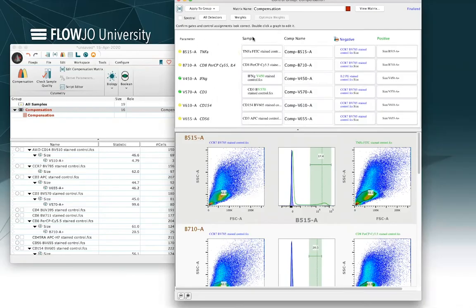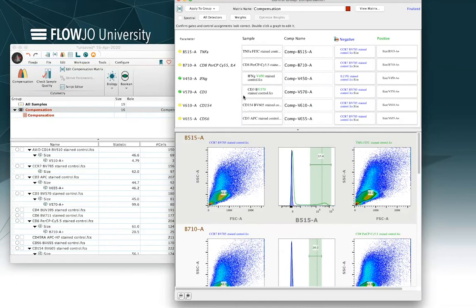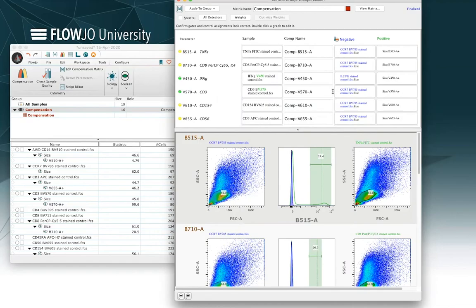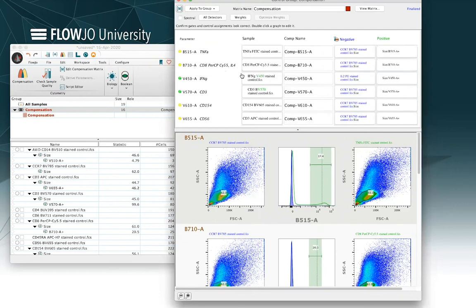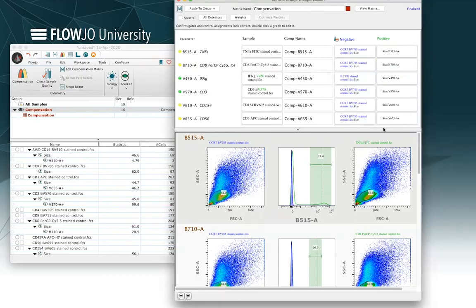In this case I'm fine with those parameters, those are the ones that I just checked. Next thing you should do is look a little bit further to the right and notice that we're selecting a sample for each parameter. In this case we've got the single stain control parameter for each detector correctly assigned. Finally, the comp name you can adjust if you want to, but I'm just going to leave the default here, comp with my detector name listed there.